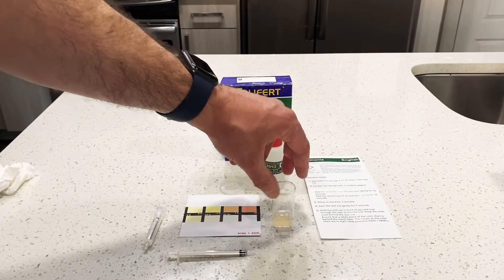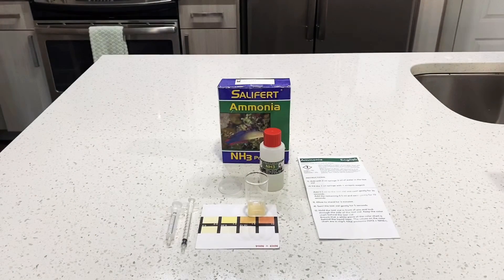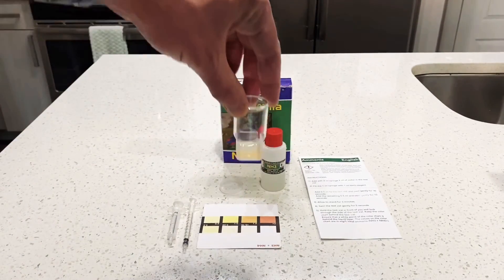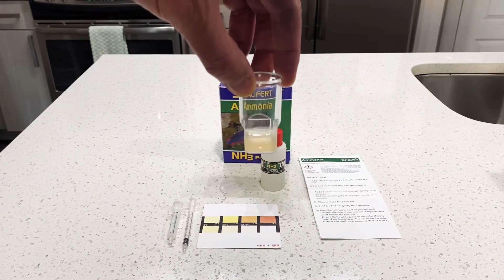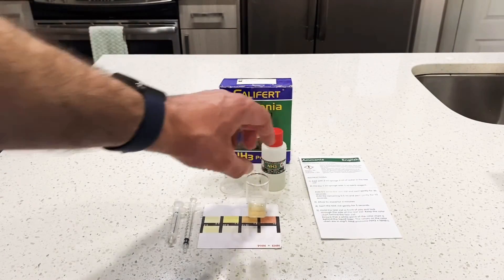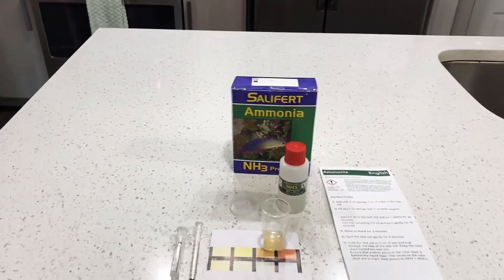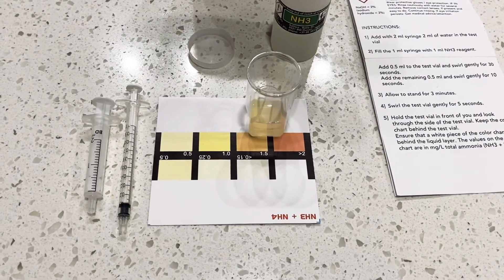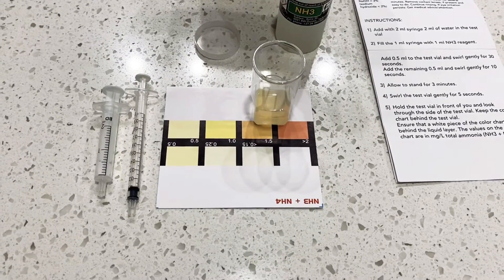Now I just let this sit for three minutes. Okay, three minutes have passed. As you can see, the liquid changed to an orangeish color. Looking through it, I'd say it's between 1.5 and two parts per million. Yesterday it was definitely a darker orange, so I believe my ammonia is going down a bit.